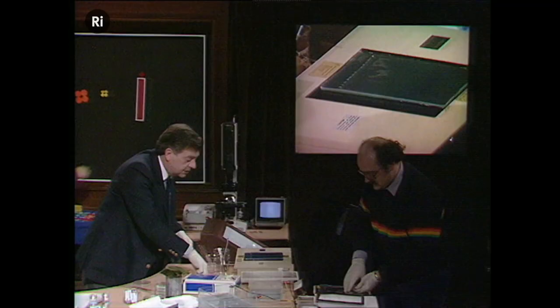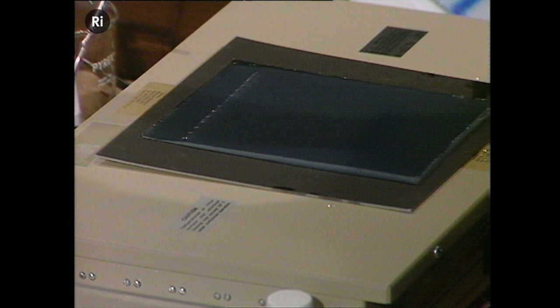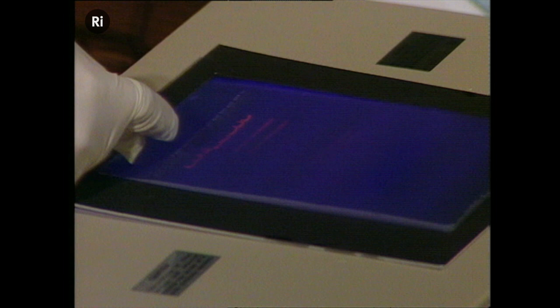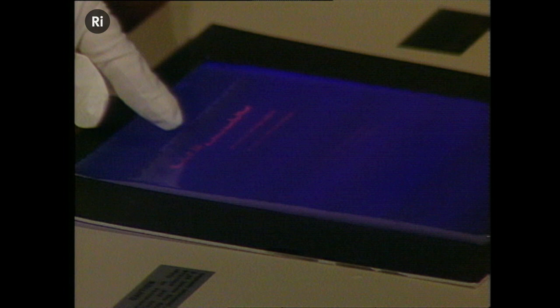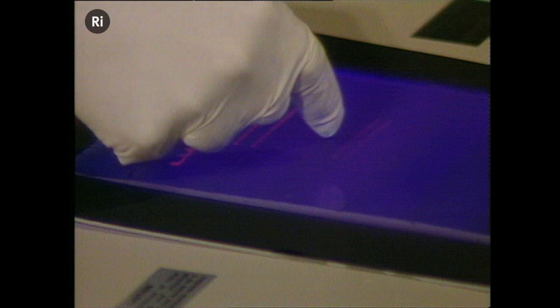Because I'm looking at this from close up, I'm going to put on these spectacles to protect myself from the ultraviolet light. Now we'll switch on the ultraviolet light, and the ultraviolet will fluoresce the samples of DNA that have picked up the dye. Can you see that? Can you see here these three columns here? You see these three? That's the DNA that's not been cut with the enzyme. When we cut the DNA with one of those enzymes, we cut it into several pieces, and we separate out the pieces. One there, one there, one there, one there, one there. Can you see those pieces?